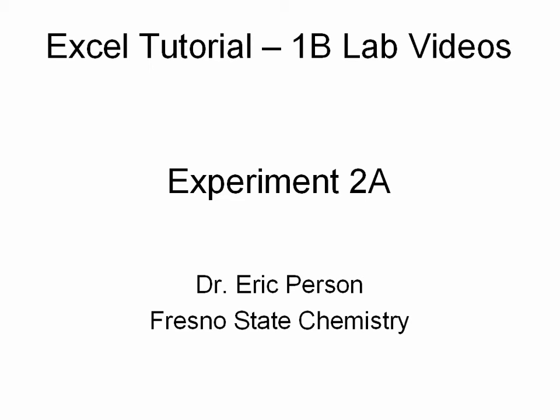Hello, in this Excel tutorial video we'll be working on the first part of the data workup for experiment 2 in Chem 1B. In particular, opening the export files from the Pasco Explorer into Microsoft Excel.